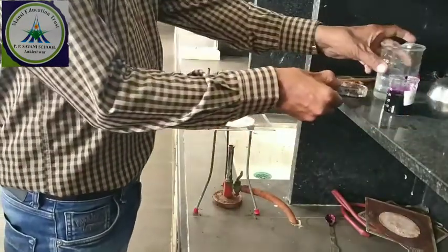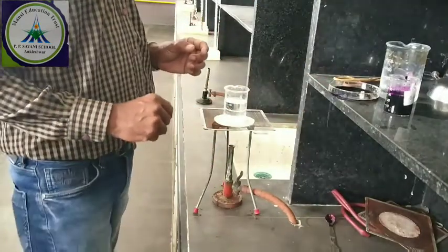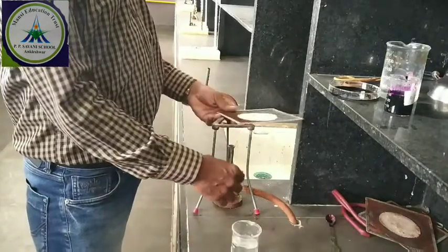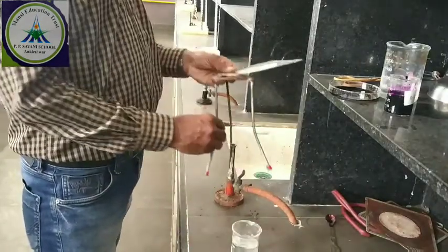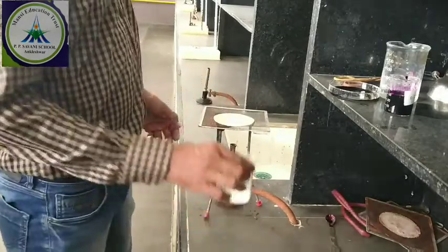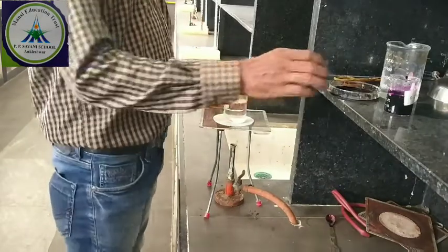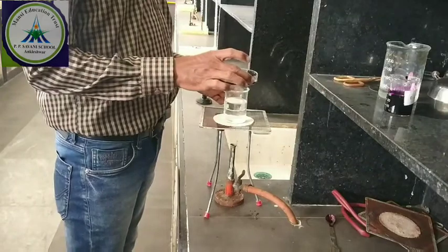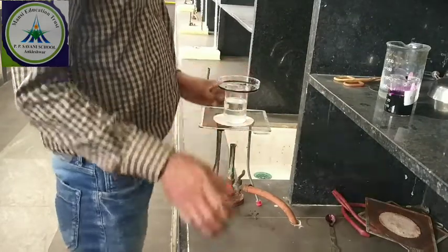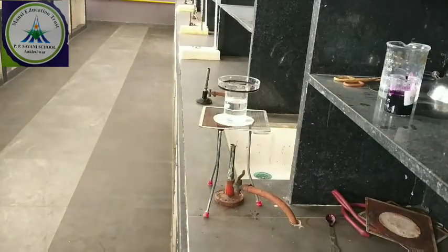Now I want to separate it, so I will do evaporation. This is the burner, this is the stand with the wire gauze. Here I have taken water in the beaker and I will put the watch glass on it, and try to heat it with the help of the burner.